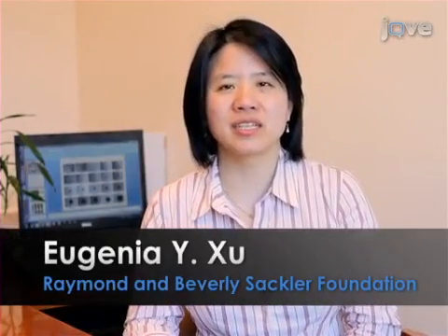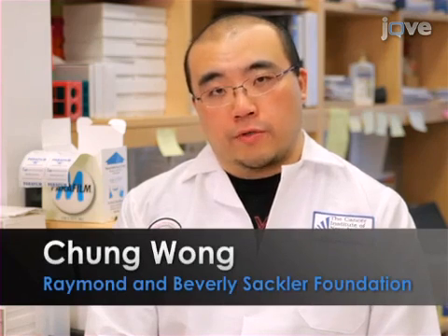The main advantage of this technique over the existing method is that it's simple, easy, reliable, and cost-effective. This method can facilitate research in the drug discovery field by helping to quickly identify therapeutic drugs for the neuroendocrine tumor patients.